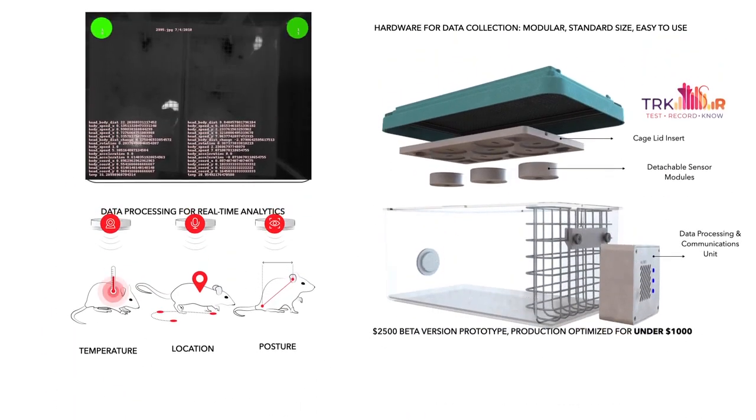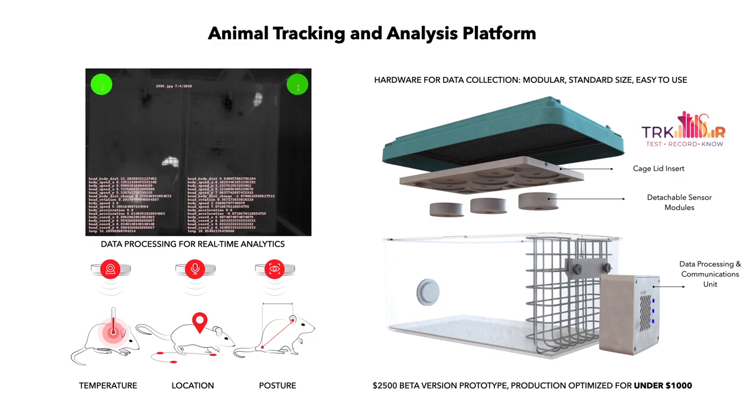Pheno Tracker is a tracking and analysis platform that is designed to collect continuous data from multiple sensors and extract characteristics of animal physiology, body vitals, behavior, and even the underlying state the animal is in. Powered by deep learning, the system provides real-time alerts, extracts meaningful trends in data, and brings the lab experiment within reach for researchers that are not present or not able to be in the lab when the animal is showing important changes associated with the studied condition.